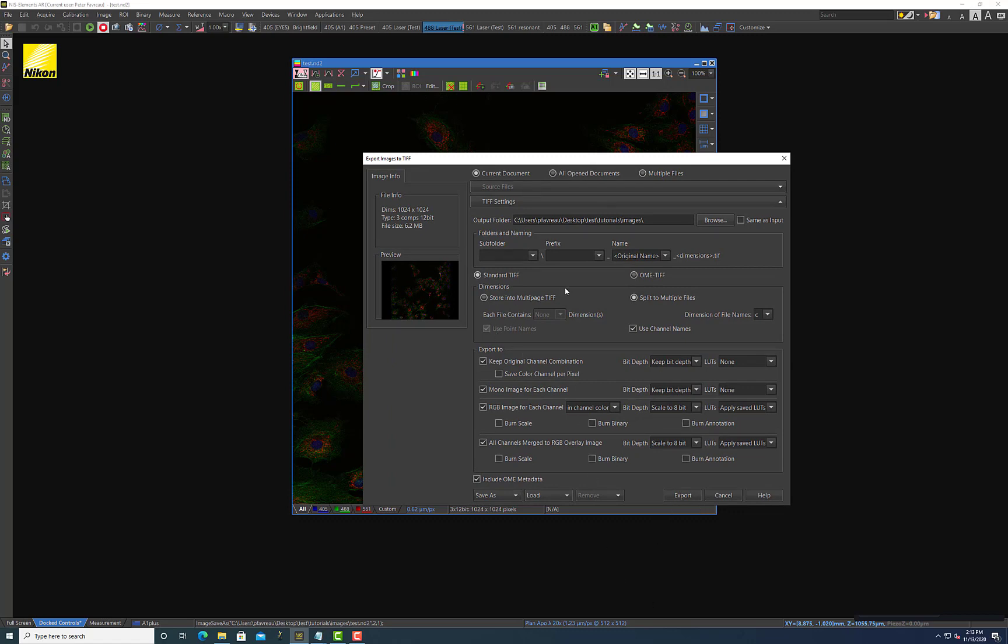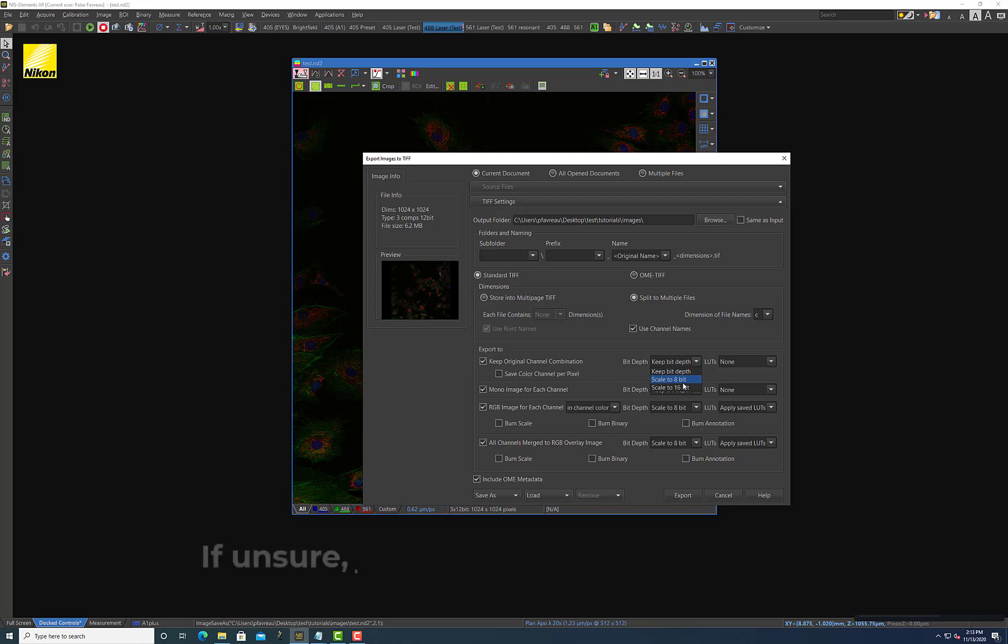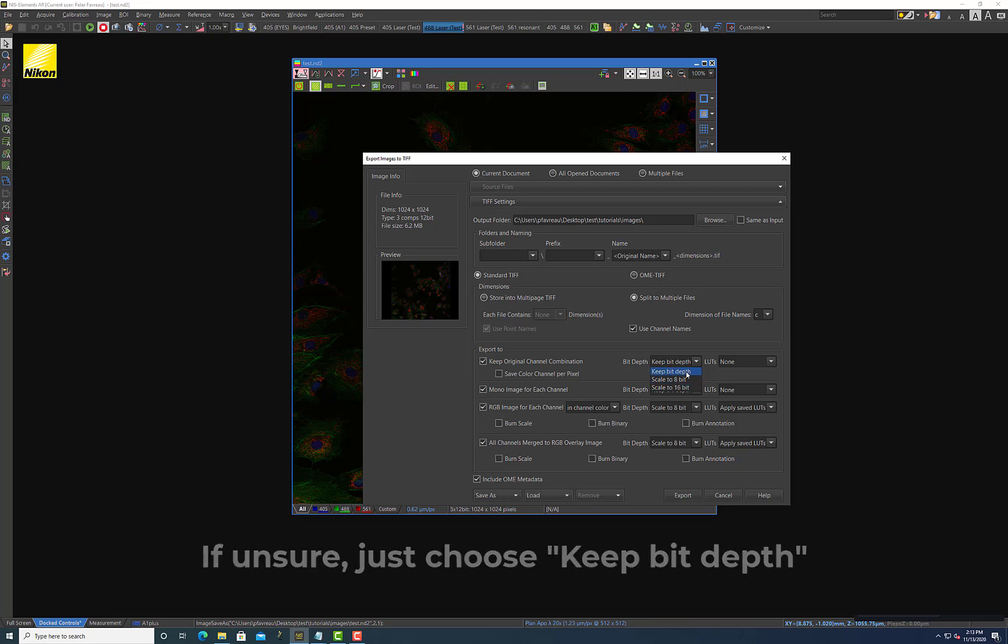So your next set of options here is actually deciding how to export your files. I usually, this first option here, I usually just keep it checked, which is just to keep your original channel combination of 405, 488, and 561. And then to keep the bit depth. So this is critical. This option right here is going to decide if you're going to compress or pad your data or your images or keep it the same. And I always keep the bit depth option. So I'm going to keep this at keep bit depth.